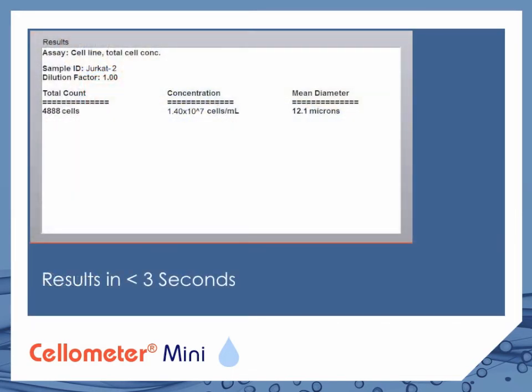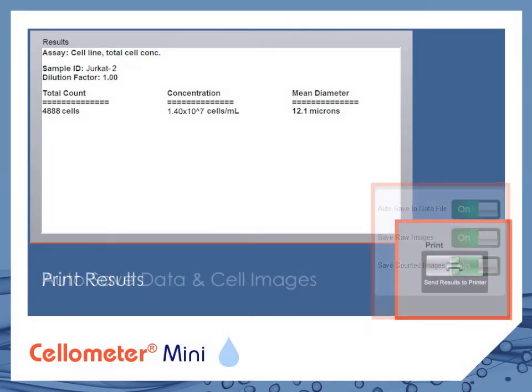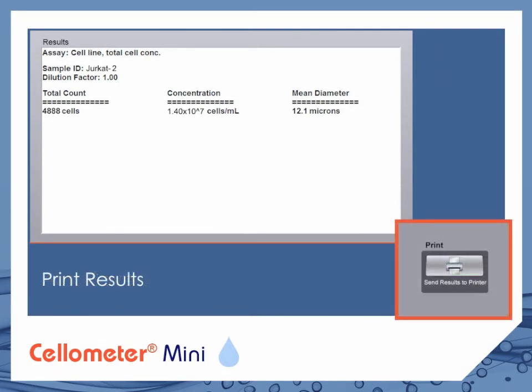Total count, concentration, and mean diameter are displayed in under 3 seconds. Data and cell images are saved automatically. Results are easily printed for your records.